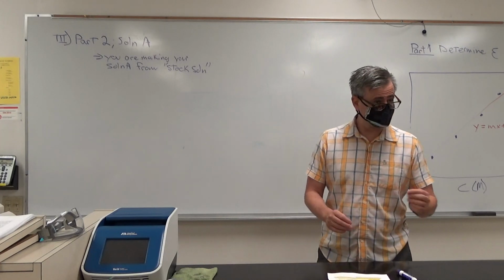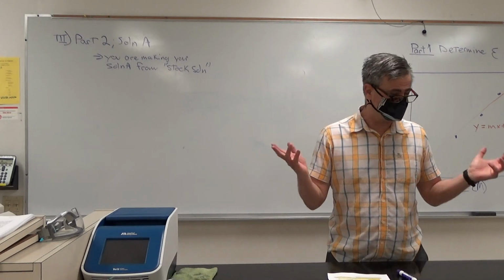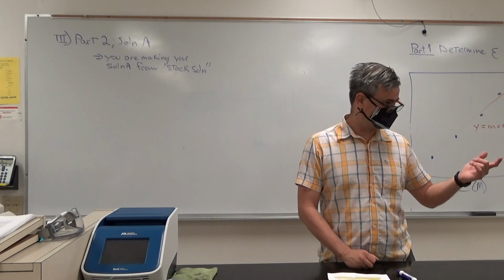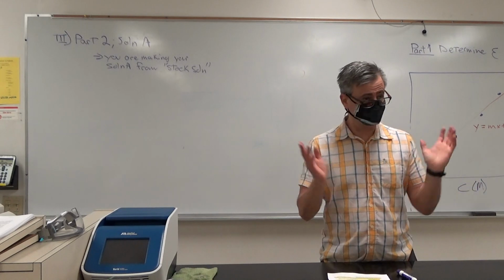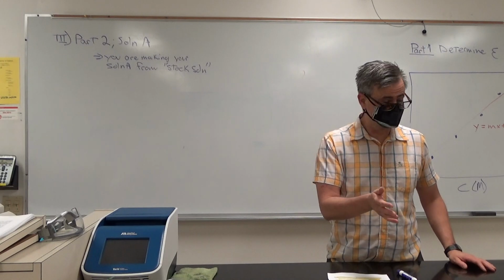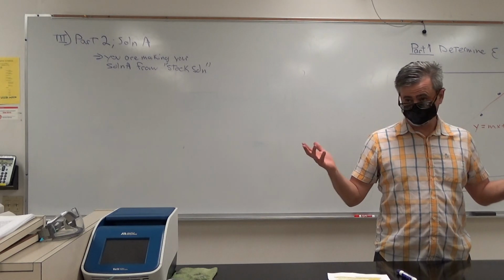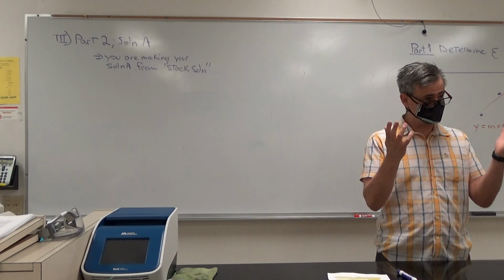I believe you're going to take half a mil of the stock solution. You're going to take your graduated cylinder. You're going to add about 19.5. Okay, you're going to pour it in there. All right. So ordinarily, you're doing a dilution. Gosh, I gotta figure out what's on the bottle and then calculate for the dilution. But you don't care. You're not doing any of that. Why are you not doing any of that? Because now that you've made solution A and you have your epsilon, you can take a sample of your solution A, measure the absorbance, and because you have the epsilon, you can figure out the concentration, right?